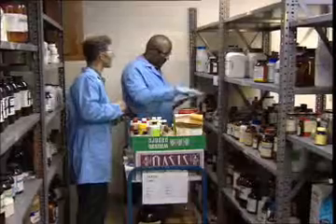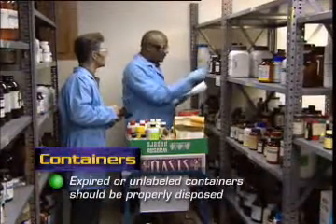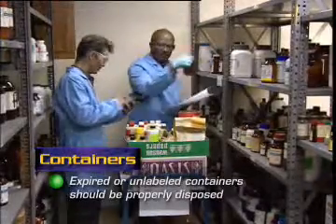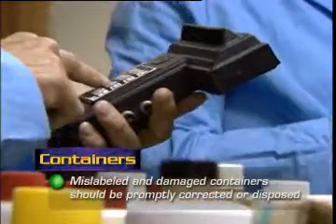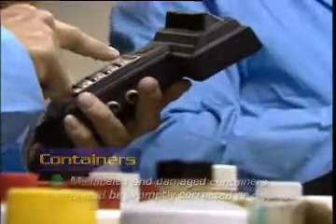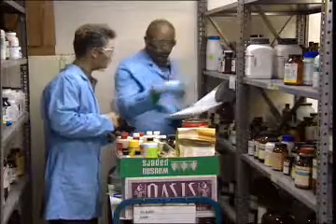Even the most closely controlled inventory procedures cannot completely screen out all materials that will eventually become wastes. Periodic lab cleanouts are needed to get rid of excess, expired, or unwanted supplies. The lab should have a written procedure and schedule for cleanouts. The chemical hygiene plan will usually describe these procedures.